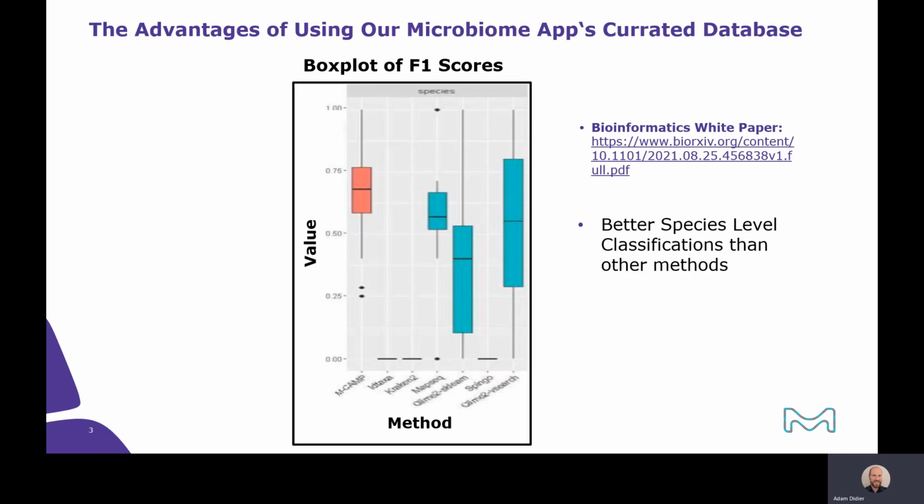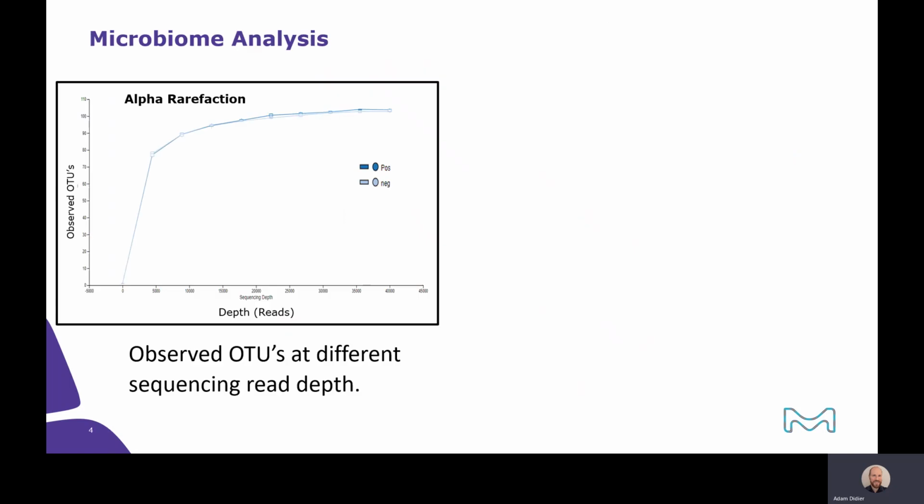On the metagenomic side, we use a manually curated in-house database to combine alignment and k-mer classification to better characterize 16S ribosomal RNA. The novel algorithm we use generates precise species-level classifications for known 16S sequences and offers better coverage for ambiguous or unknown 16S sequences than other approaches. The app's curated database resolves ambiguities found in other publicly available databases.